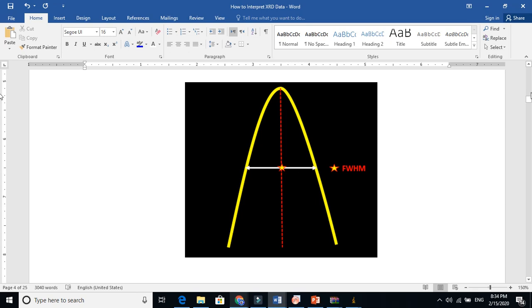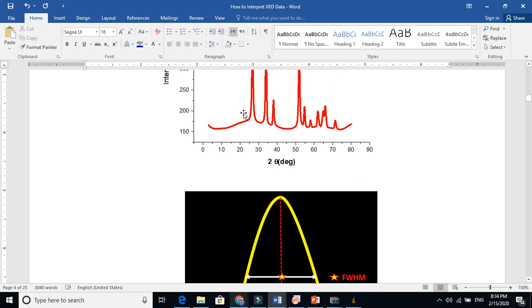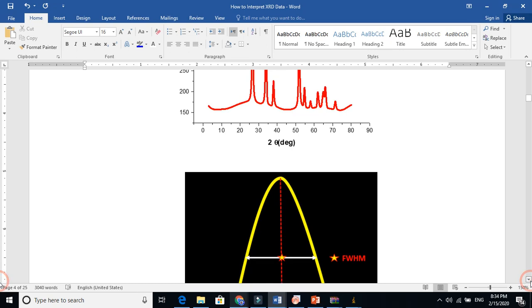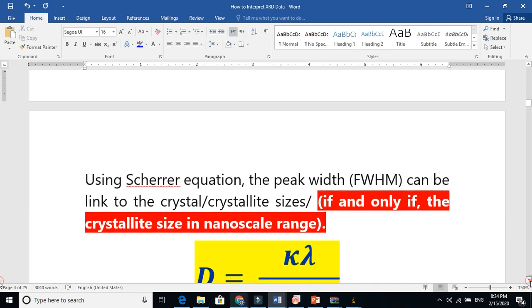It is in 2 theta, if you look above here. It is in the 2 theta. So we have to take this in radian. This full width half maxima, we have to take in radian.